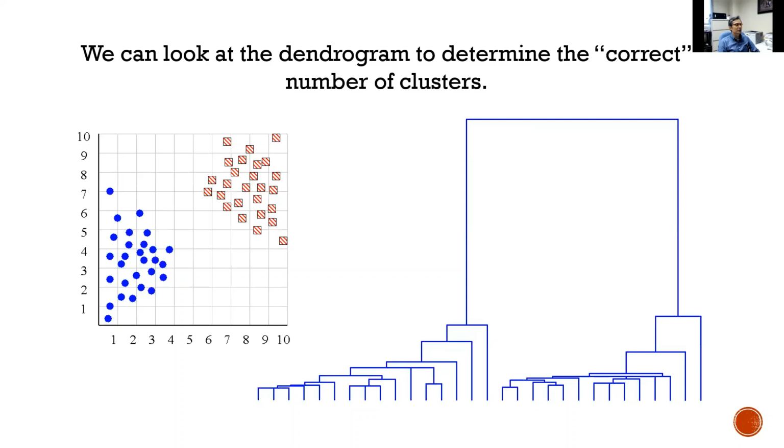When you apply this to clustering examples, we can build a distance matrix first between data points, and then start to build this tree. You can separate the data points by looking at the internal branches. If you cluster the data points into 2 groups by looking at this level of separation, you will clearly separate the 2 groups of data.